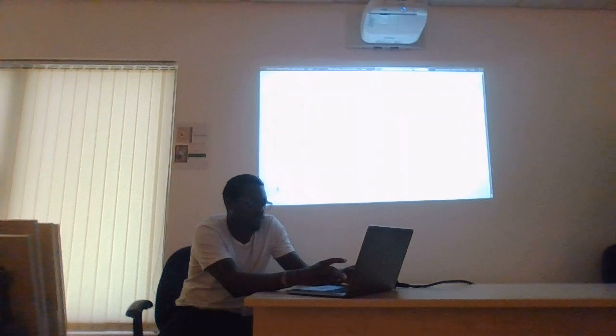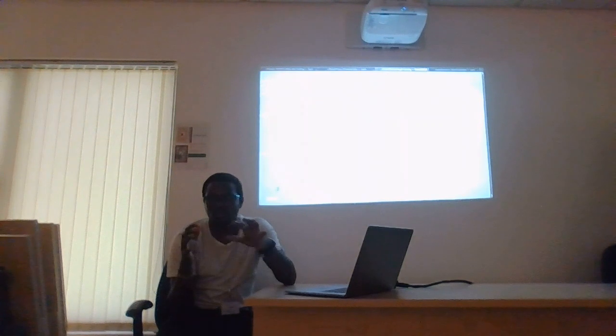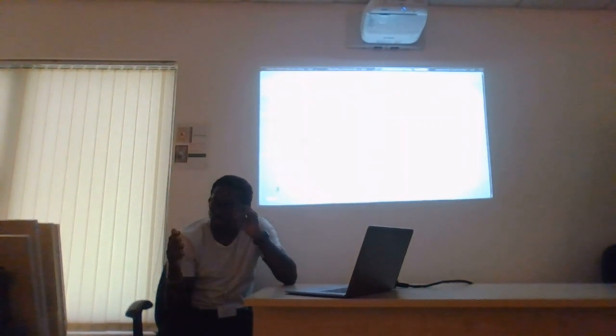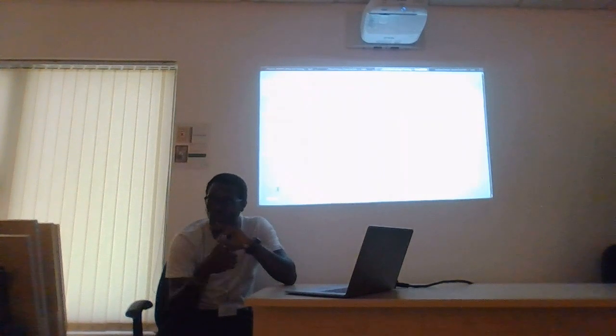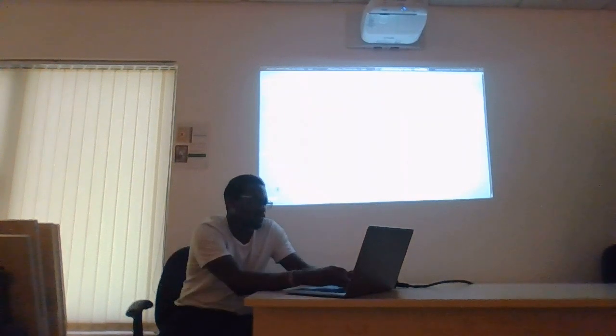So what does that new Salmon index mean? It's in quotes because we know that we want to create a directory, a channel comprising a directory, so a path to a directory called salmon index. We don't have it, but Salmon will create it. Yeah. So what was the other thing?